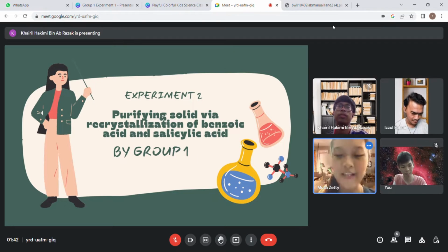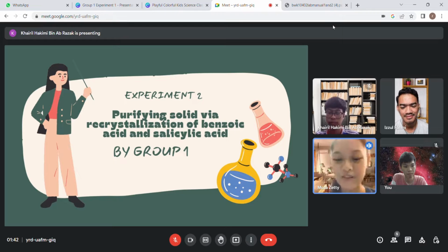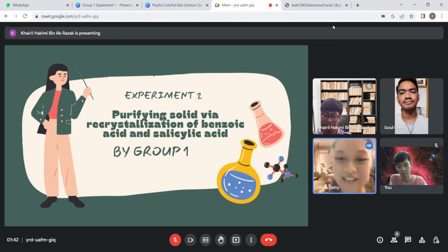Hi everyone. In this video, we will present our lab experiment 2. The title of this experiment is Purifying solid via recrystallization of benzoic acid and salicylic acid.